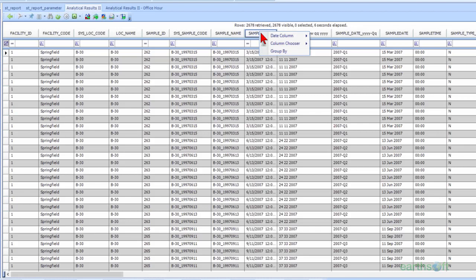Okay, let's maybe start with something like, maybe we're looking at sorting a particular crosstab set of data, and we want to sort by year, month, day. We can go year, month, and then day.